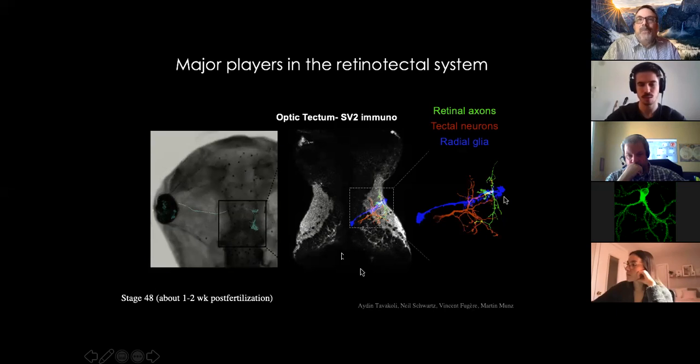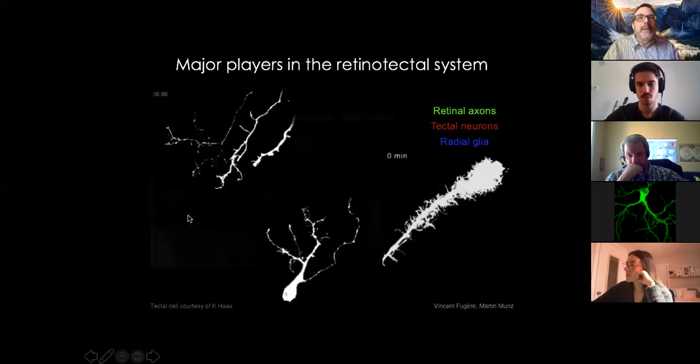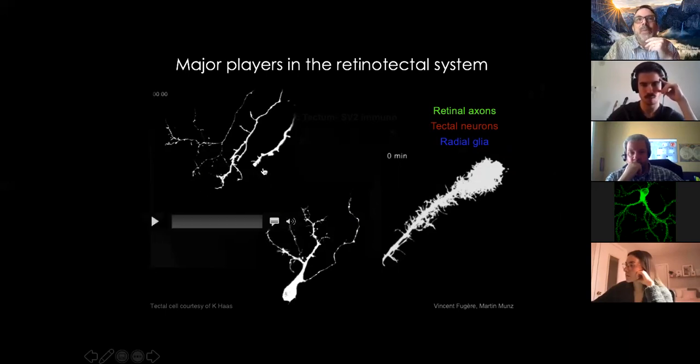And it's pretty straightforward to use electroporation to label these cells, and so you get images like this. So this is a two-photon image of three retinal ganglion cell axons that happen to be labeled growing into the optic tectum. And what's nice here is that we caught them at three different developmental stages within the same prep. So this axon has a big growth cone at the tip and is growing towards its target. This one has already reached its target and has extensively ramified, but they're still highly dynamic at this point.